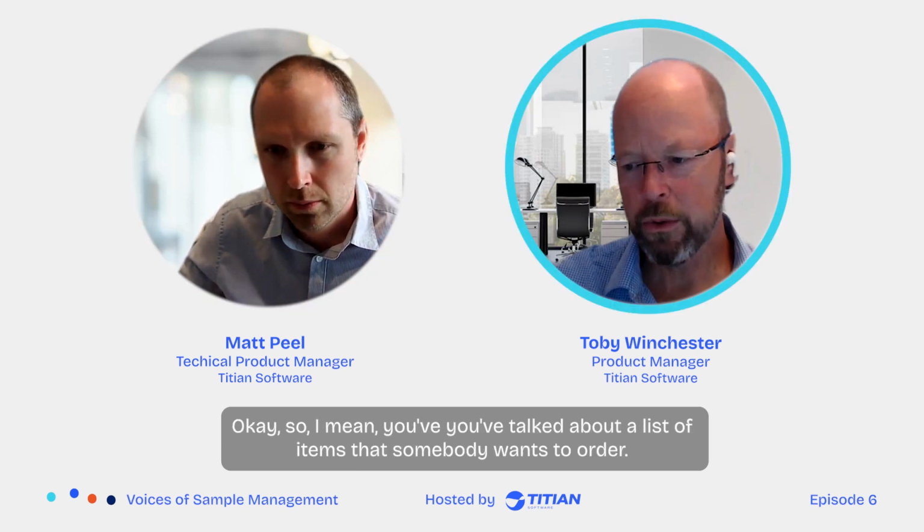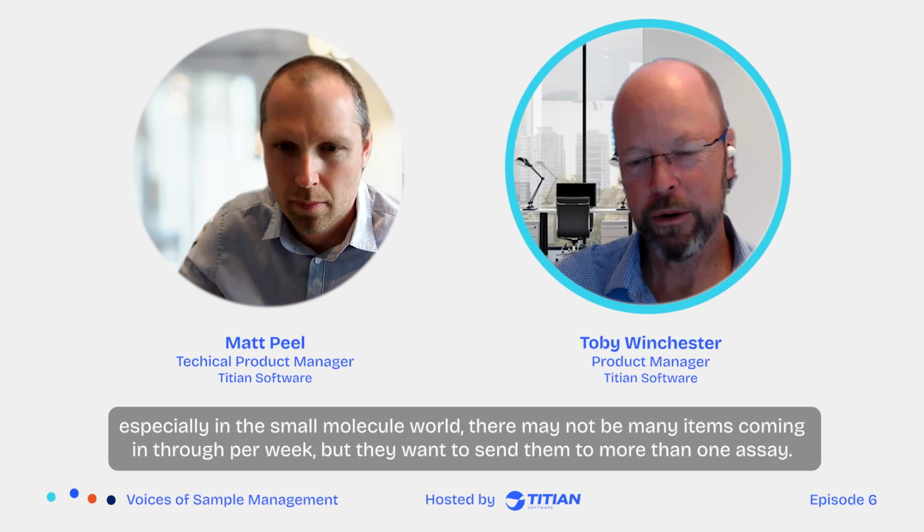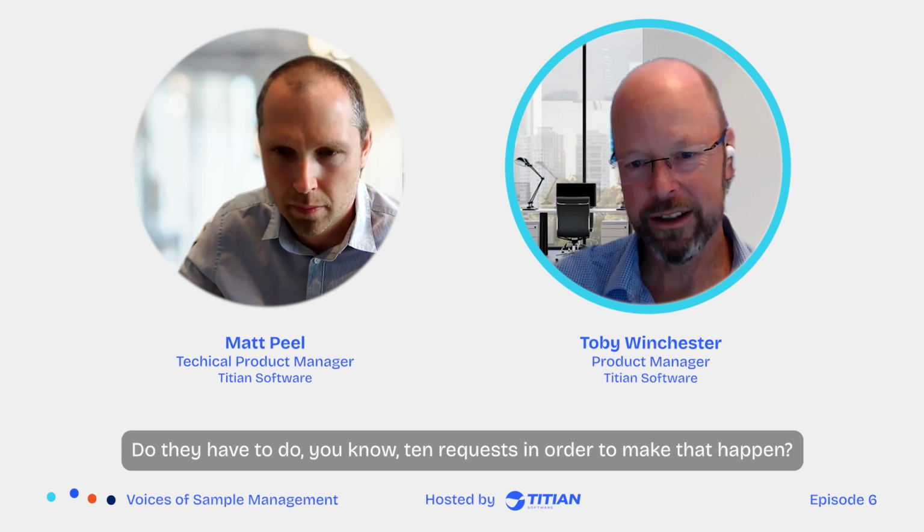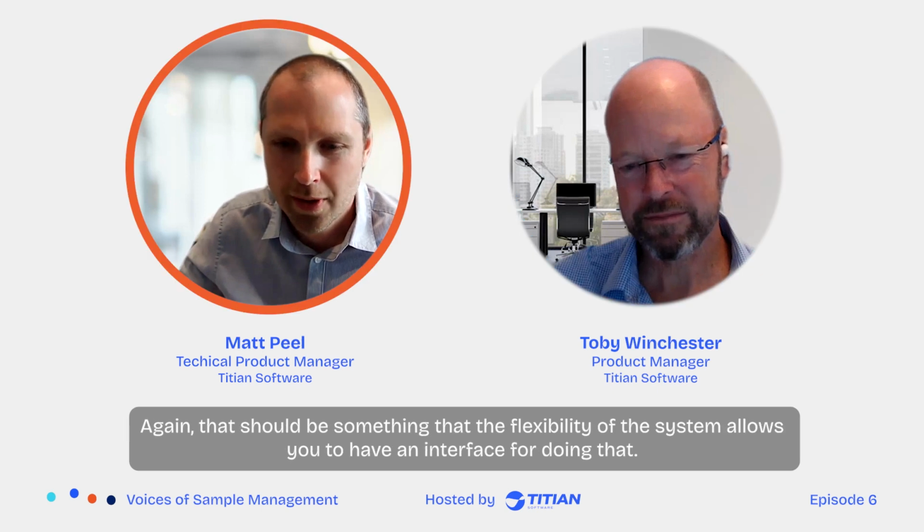Okay, so you've talked about a list of items that somebody wants to order. What happens if a project scientist has very few items, unfortunately, especially in the small molecule world, there may not be many items coming in per week, but they want to send them to more than one assay. Do they have to do 10 requests in order to make that happen? Well, again, the flexibility of the system should allow you to have an interface for doing that.